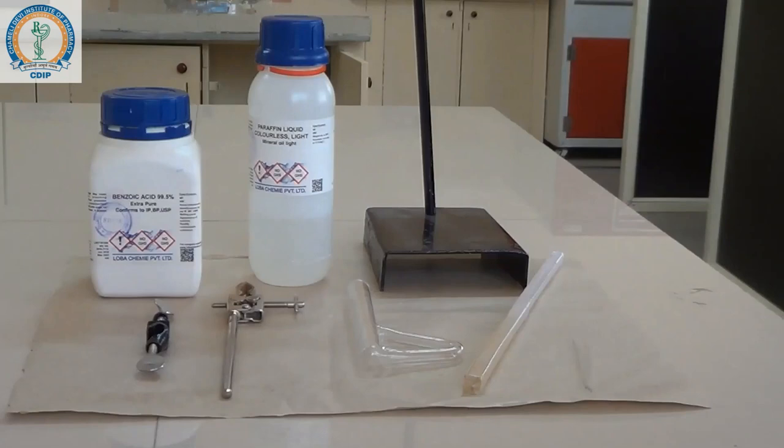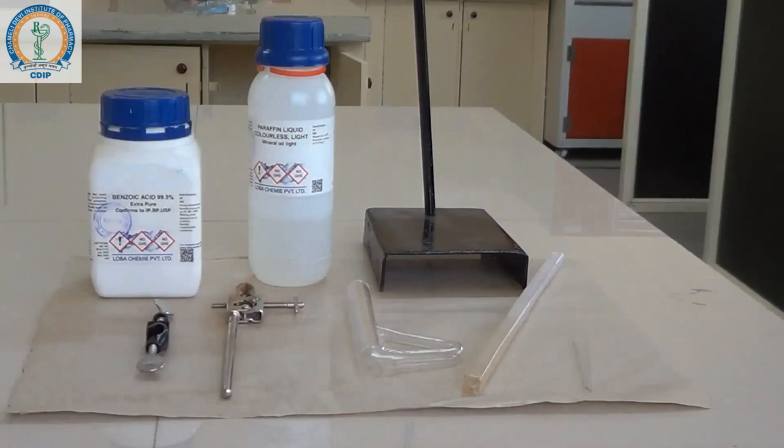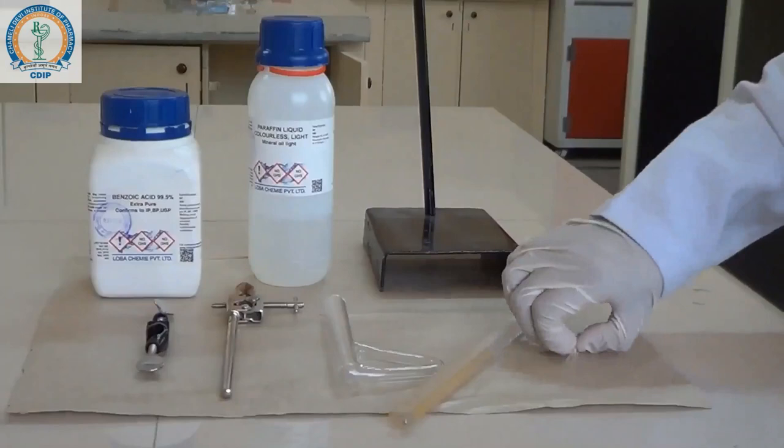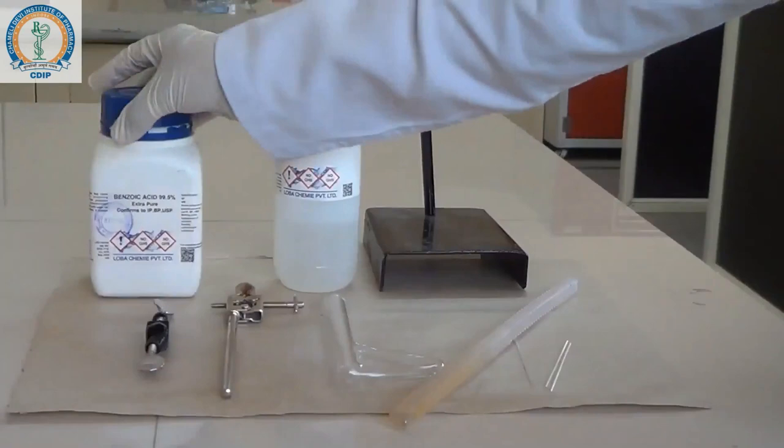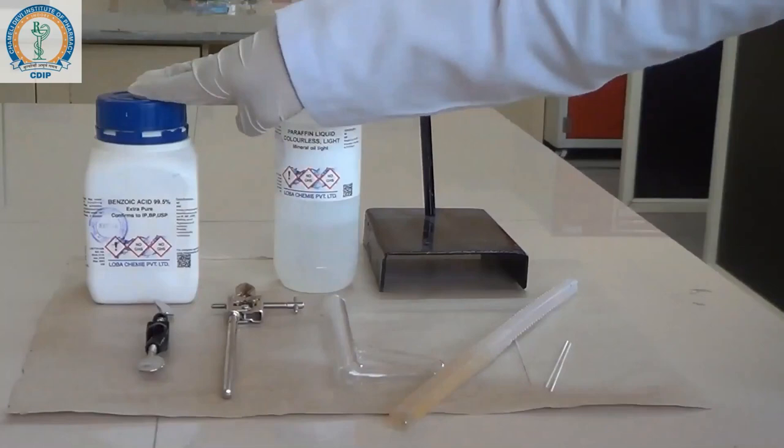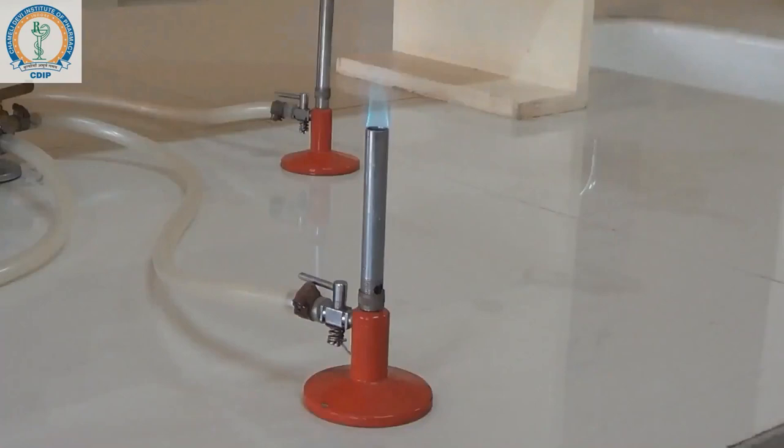The requirements for melting point determination include a Thiele tube, thermometer, capillary tubes, clamp stands, liquid paraffin, and the sample—benzoic acid in this case—of which we need to determine the melting point.